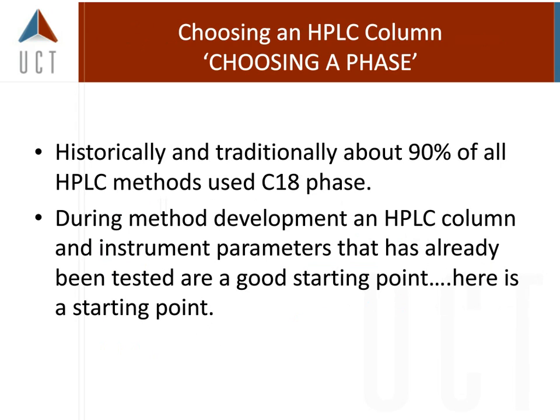My refresh seems to be slow, but historically we're all used to reverse phase C18 chromatography. More recently, probably within the last 6 to 8 years, a lot more phases are being used, primarily PFP, biphenyl, and phenyl phases for LC chromatography. These have application in the solid phase extraction field as well. And we at UCT have looked at a vast number of these and really honed in on some of the applications that are useful now, especially in the forensics and environmental markets.